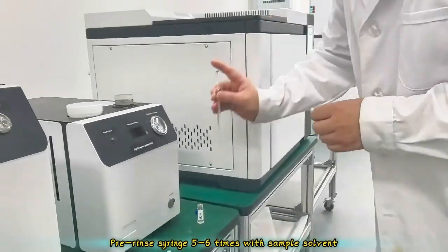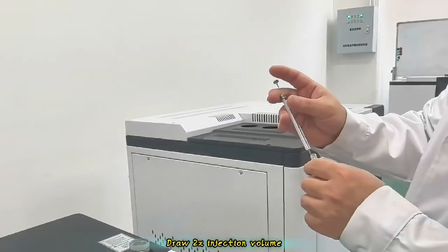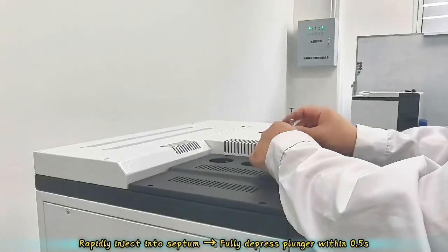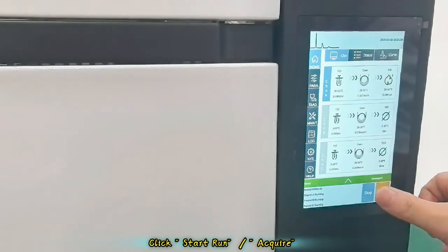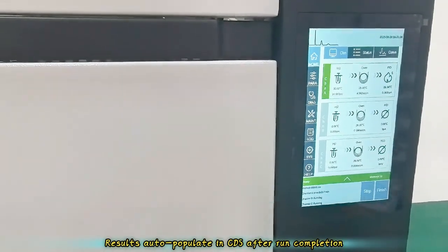Pre-rinse the syringe 5 to 6 times with sample solvent. Draw 2x the injection volume. Orient the needle upward to expel bubbles. Expel excess sample, then rapidly inject into the septum, fully depressing the plunger within 0.5 seconds. Click Start, Run, Acquire. Results auto-populate in CDS after run completion.